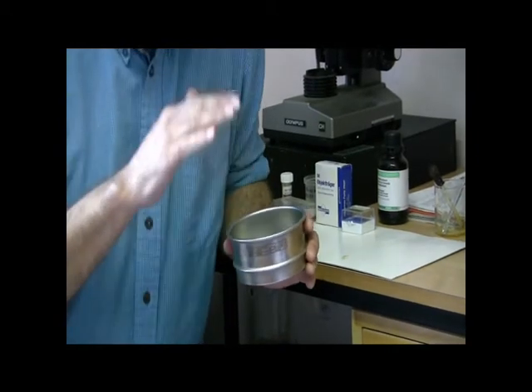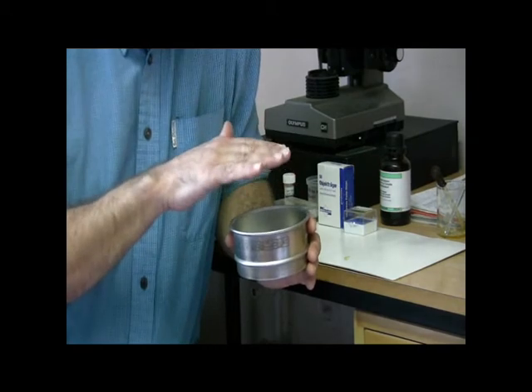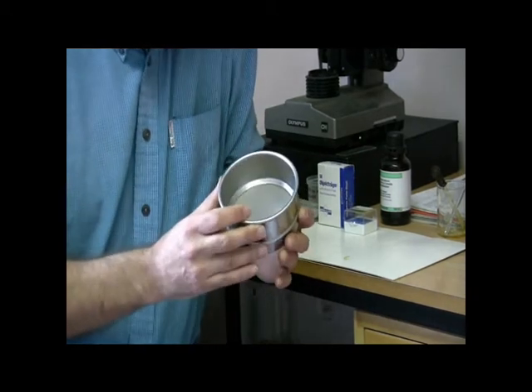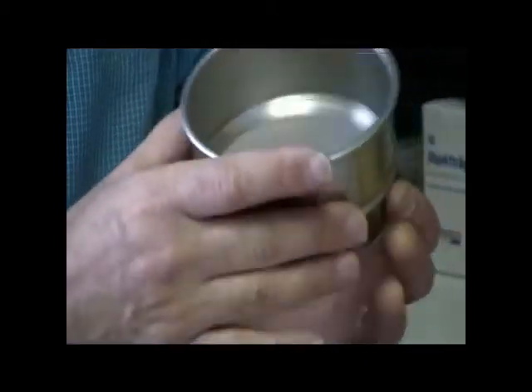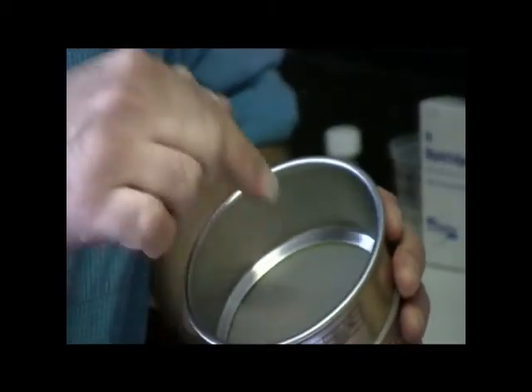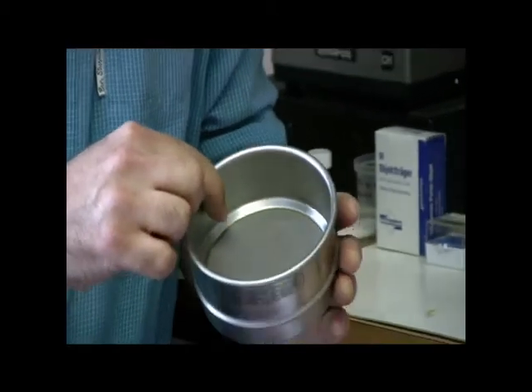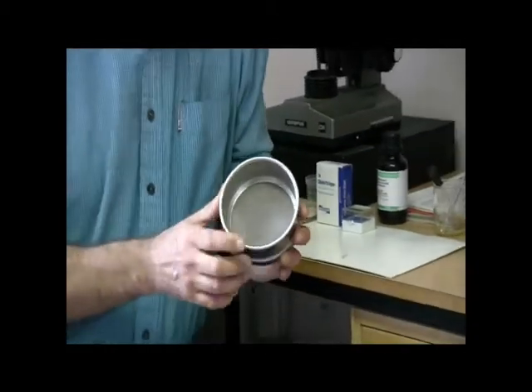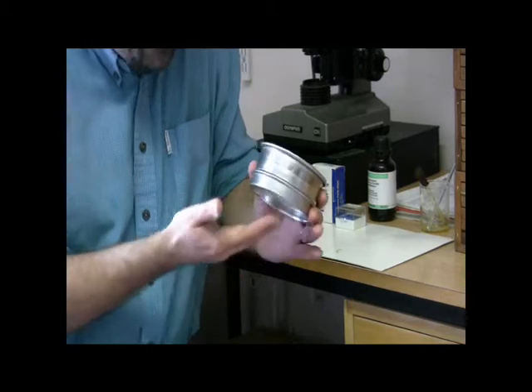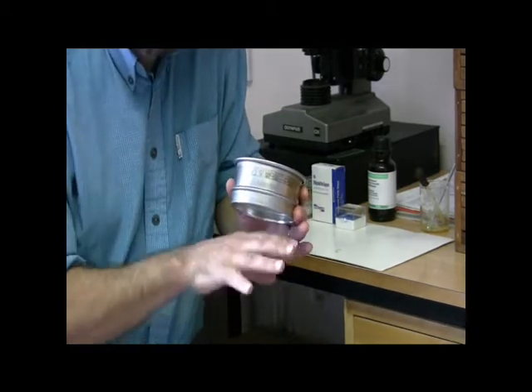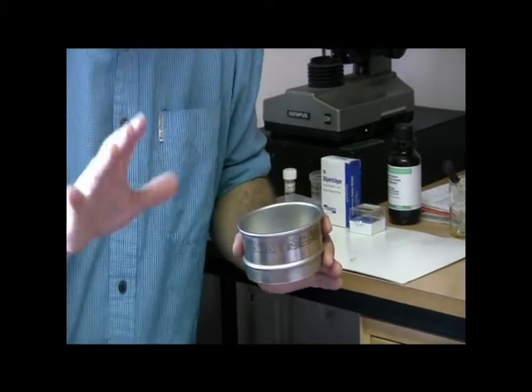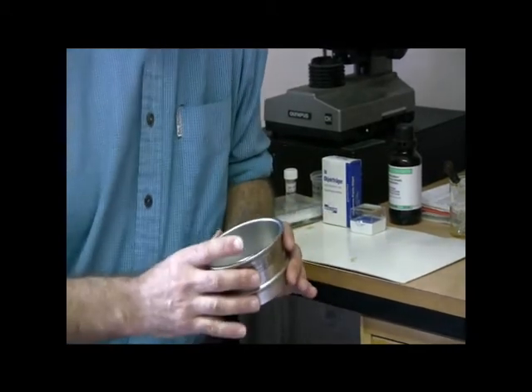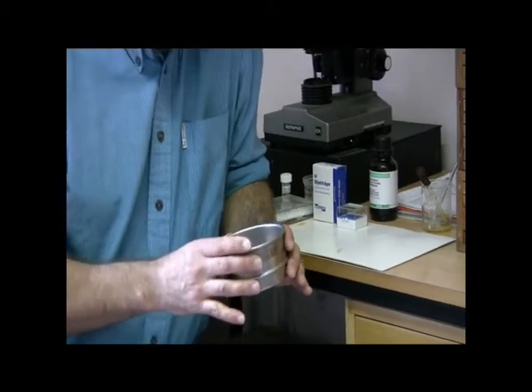Everything finer than 150 microns would go through the top sieve, and everything greater than 63 microns would be caught in this lower sieve. It's the material that's caught in this sieve that will contain the radiolaria that we want to look at. Everything that goes through, we're not really interested in that. Everything caught on the 150 micron sieve, we're not really interested in either because that's probably too big for the radiolaria we want to look at.